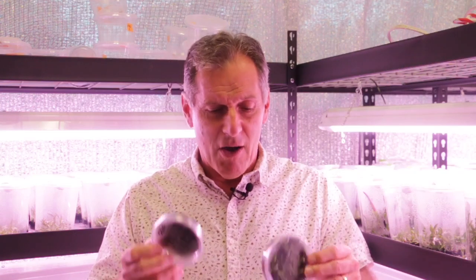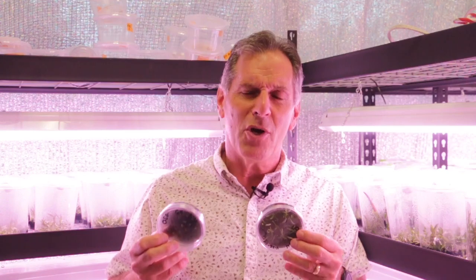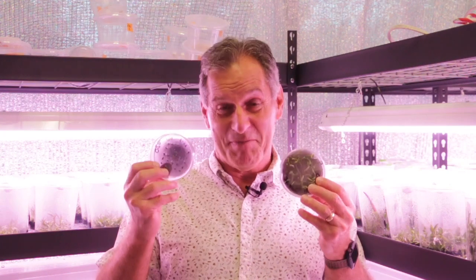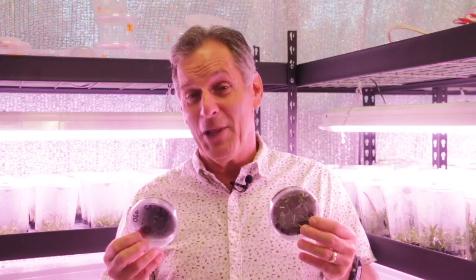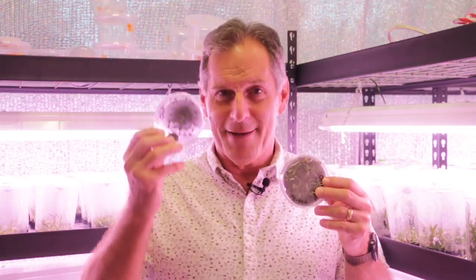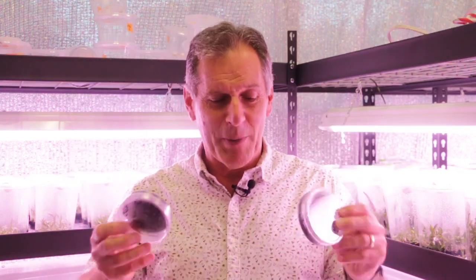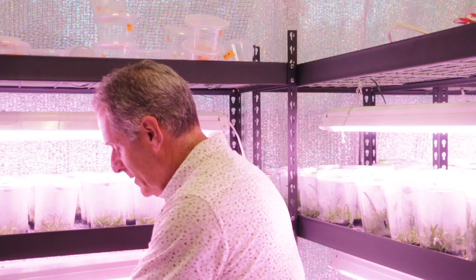The results are striking. The replate medium gives really enhanced root growth, which for ghost orchid — which is essentially a collection of roots — is key. All orchids' roots are the secret to growth. This medium I developed for replating gives incredible root growth with most of my other orchids, and it does the same for these ghost orchids. The results are strikingly clear. There is no doubt in my mind that the replate medium is much better for subsequent ghost orchid growth than the seed germination medium.